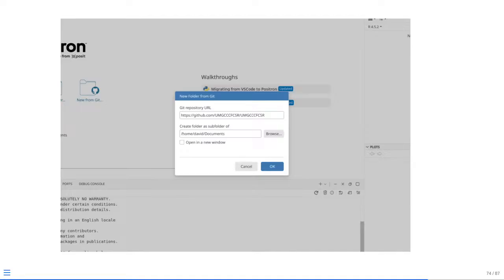computers and are using OneDrive or Dropbox or other cloud storage devices. Please don't store the code files that you plan to be actively working with on a remote location like a cloud. The reason for that is if it's trying to sync both the local and the remote copy, it's going to lock those files. So if you're trying to edit them in real time, you're going to run into permission issues and it won't let you proceed.